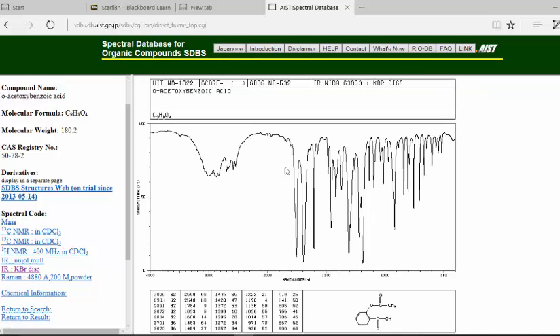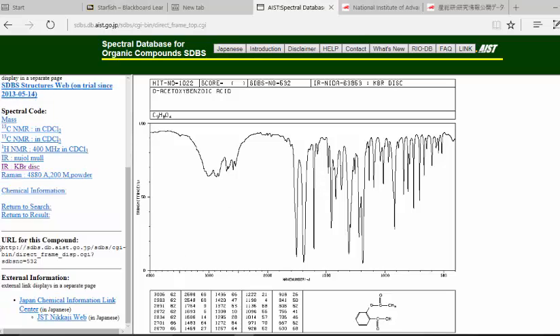So this is the infrared spectrum for aspirin. And you can do the same thing for the other compounds.